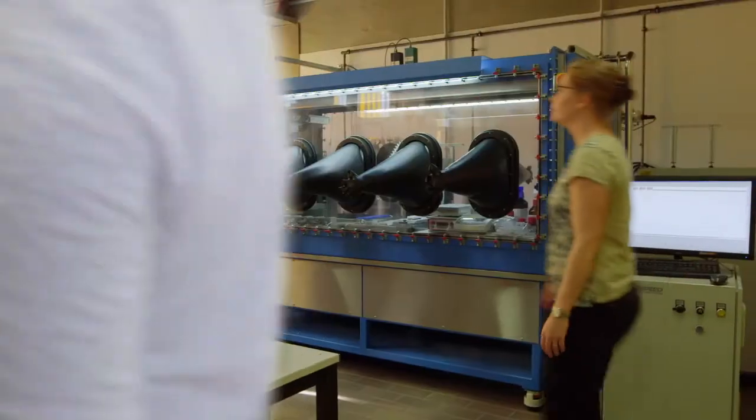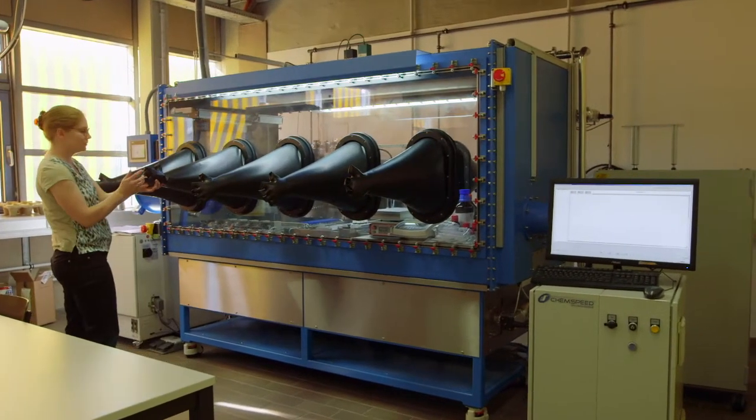Today, the complete production process of functional particles is operated by an automated robot.